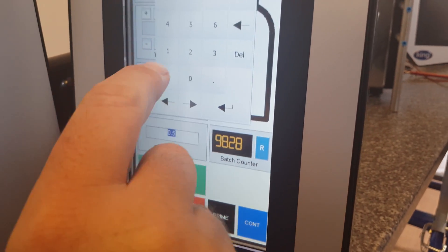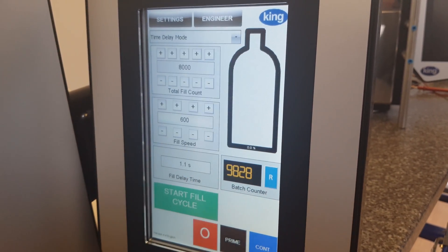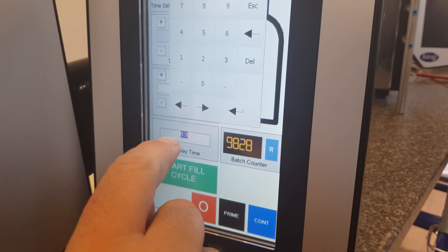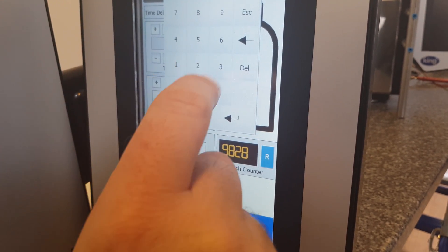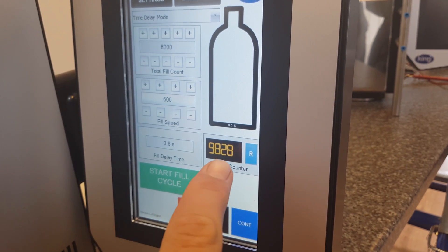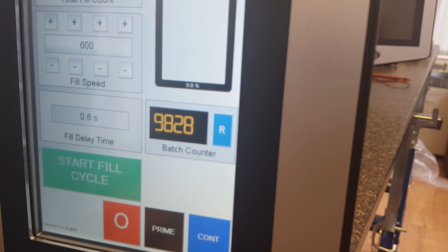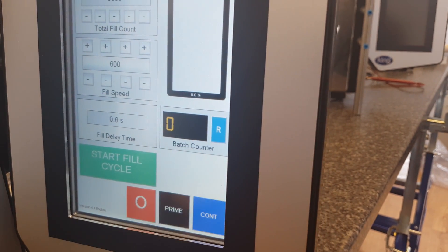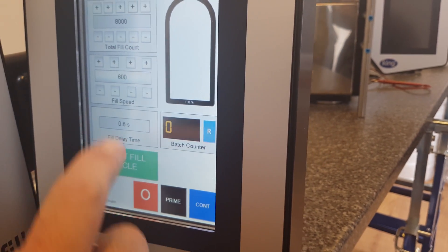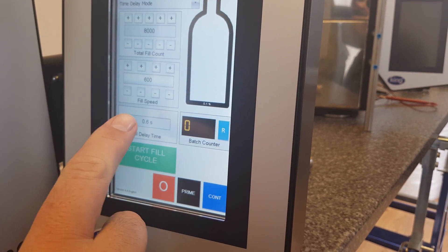We can set the time in seconds — say 1.1 seconds, or if we want to be quicker, 0.6 seconds. We have a batch counter which has done 9,828 cycles. We can set that back to zero, and as we do a cycle it will go up. So at the moment we've got it in time delay mode.